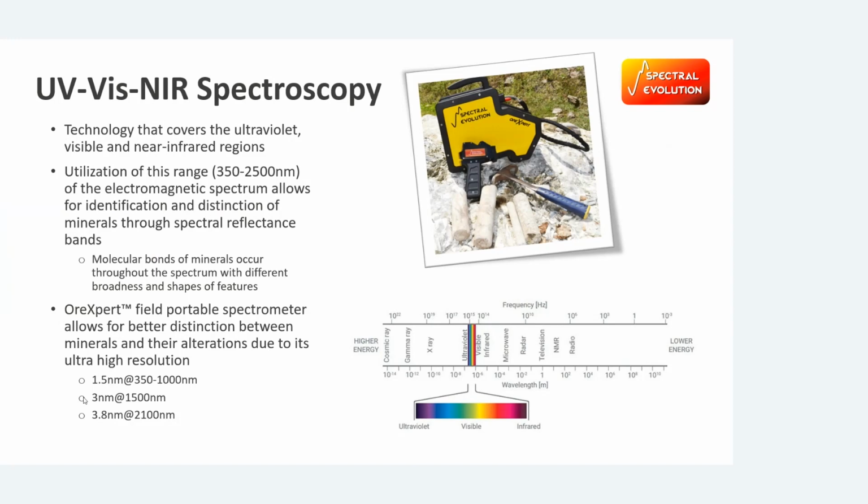This is done by using an attached accessory that has a built-in internal light source, which eliminates the effects of atmospheric water spectra, allowing for a lot more applications than just ground truthing remotely sensed data. So in general, this really changes the way exploration is done and how us geologists think, as it provides more instant information about these minerals, which is why we chose to use it for the CO2 mineralization application.